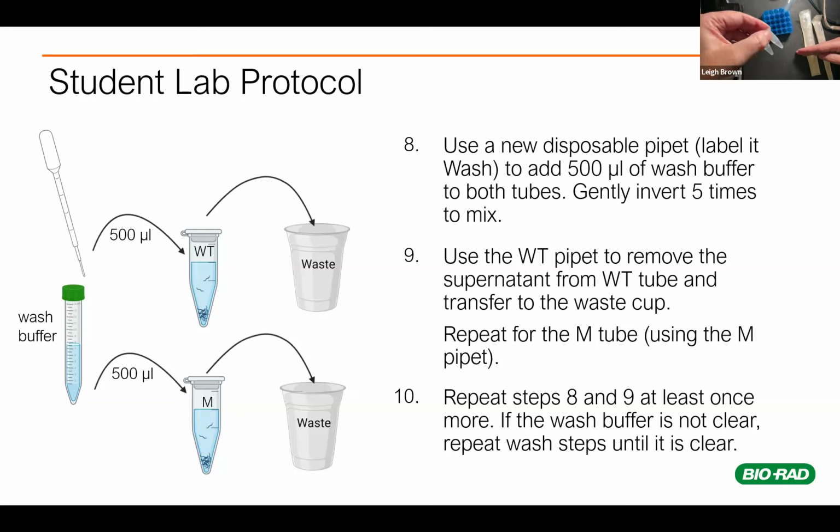And what you should see is like what Lee has seen with hers, which is now pretty darn close to what the wash buffer looked like. Once you hit that point, you know these worms are pretty darn clean, and you probably no longer need to do an additional wash.